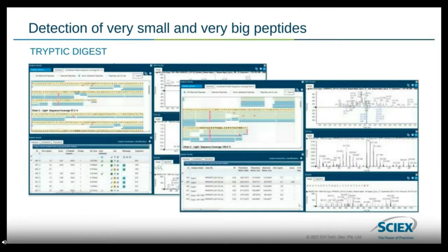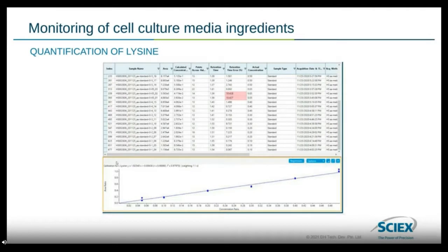They usually elute quite late in the waste fraction of the LCMS run, and therefore also there we can't get very clear spectra. Due to the orthogonal separation technique, like ZipChip or CE in general, we were able to detect those peptides, which are challenging in LCMS.